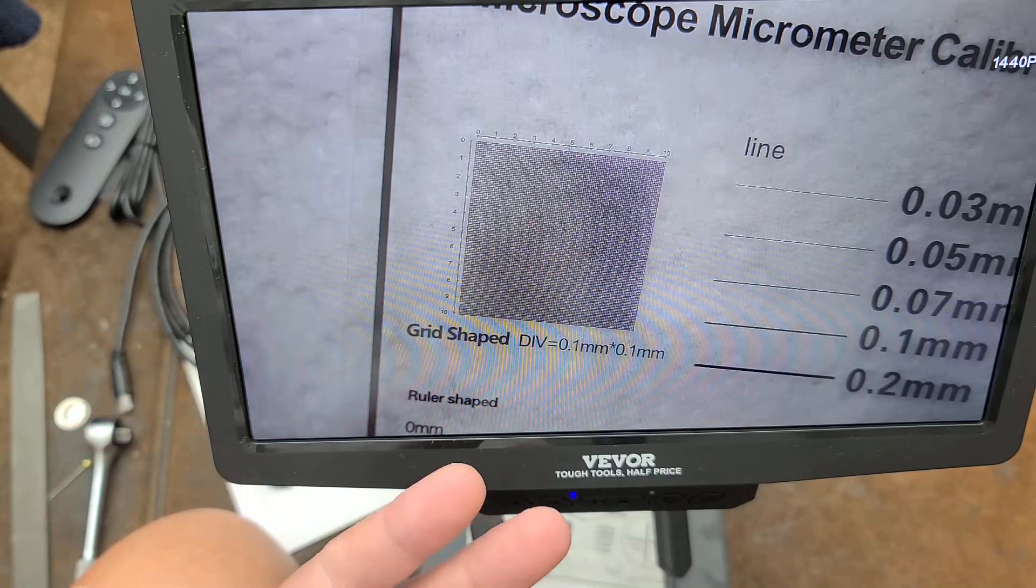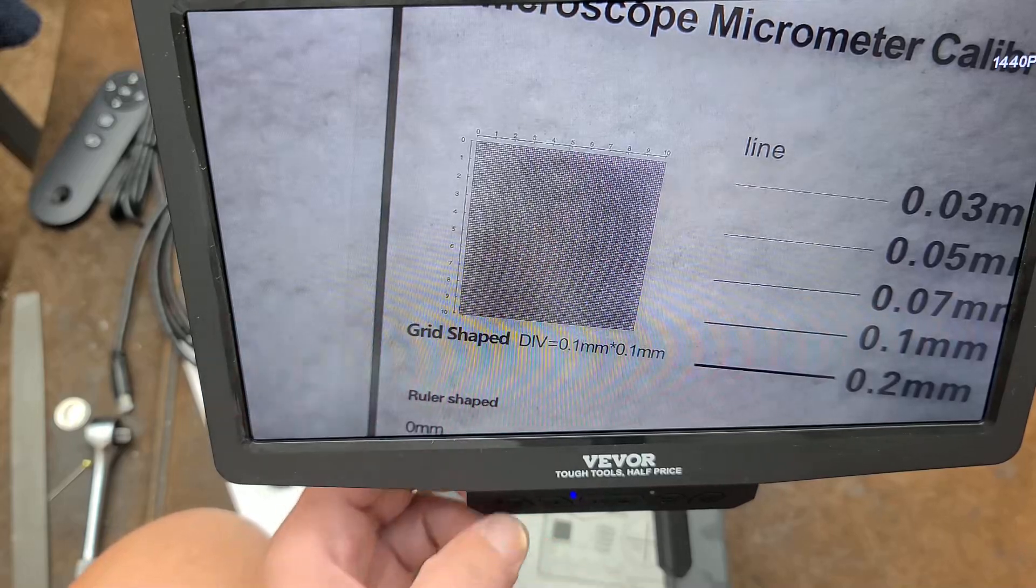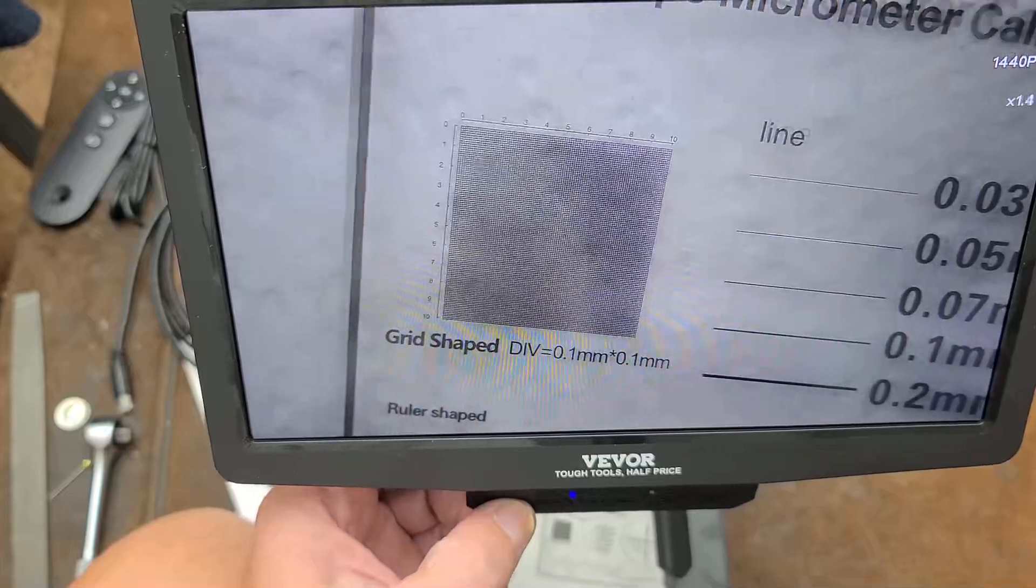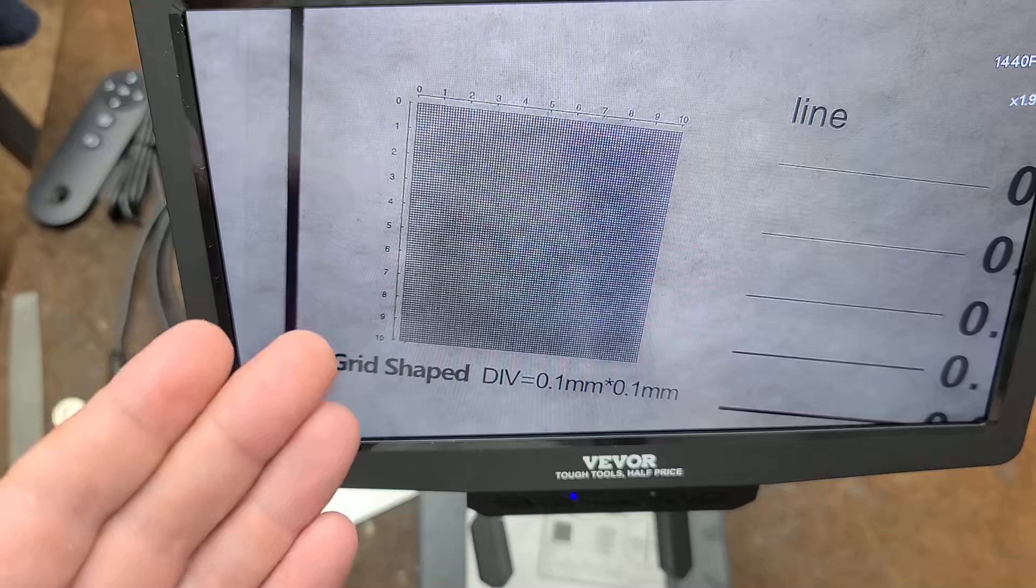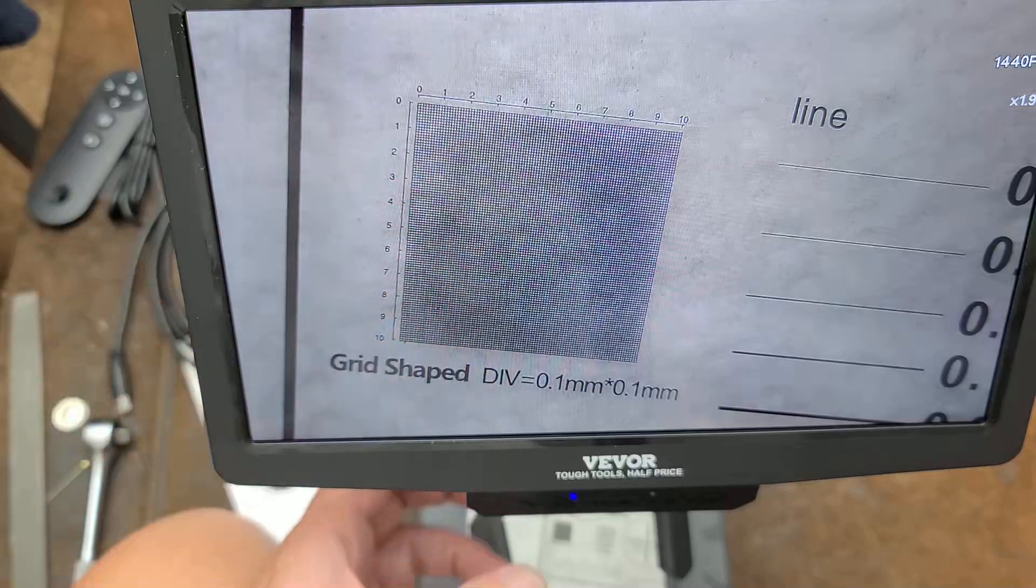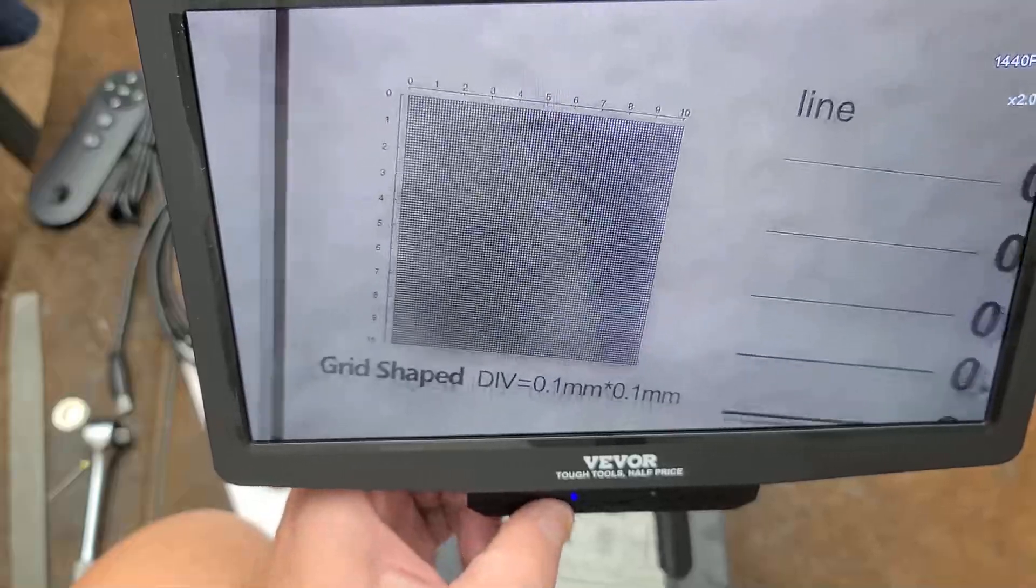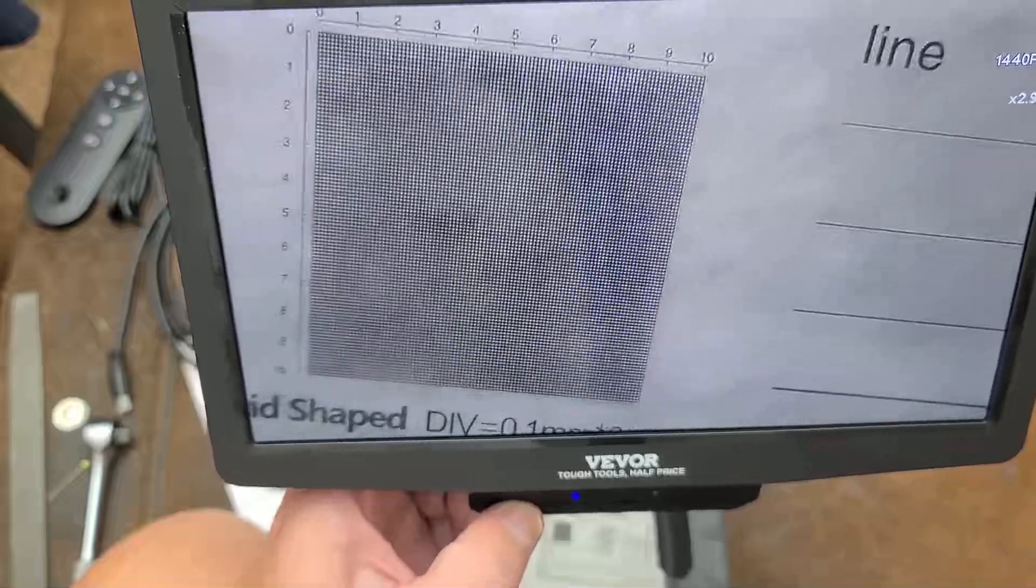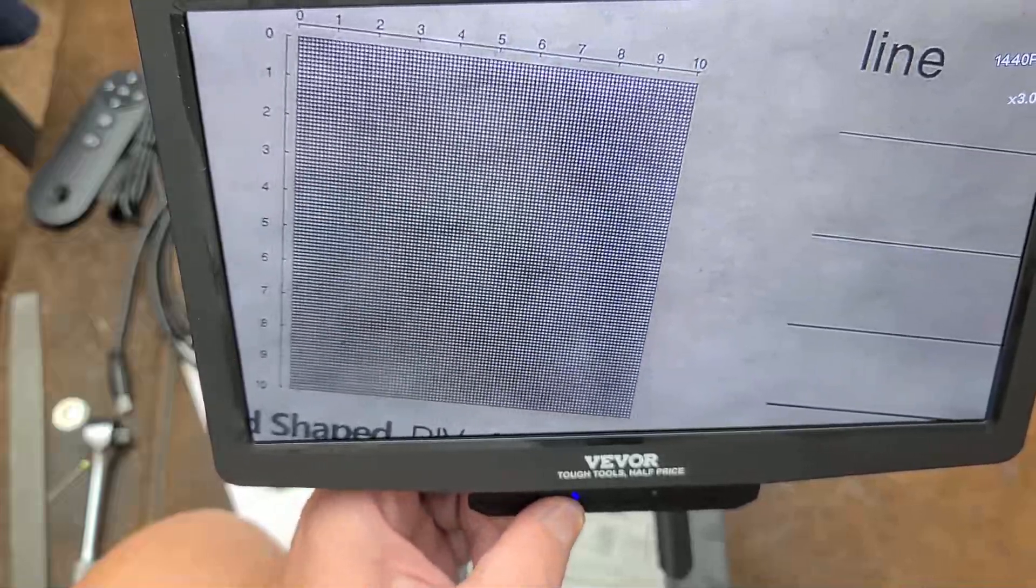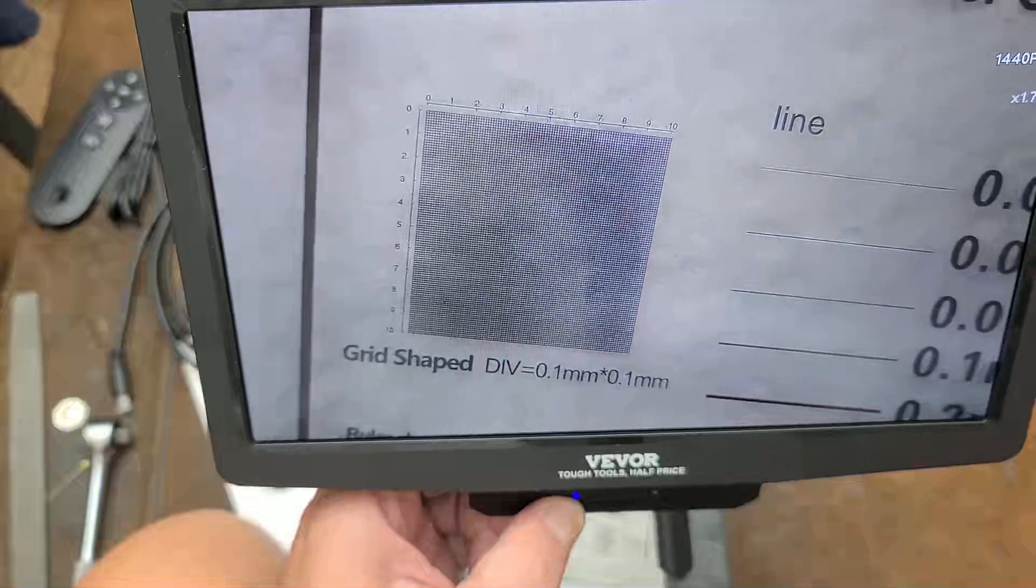You can start to see the pattern there. This screen has a reasonable level of brightness. It's actually 10 inches, so it's kind of funky. I think it has kind of hard to find, like a 400 to 600 times optical, and then you do have a digital zoom. Overall it works pretty well. This is actually a 1024 by 600, so known as a 600p screen, but it records in far higher resolution than that.